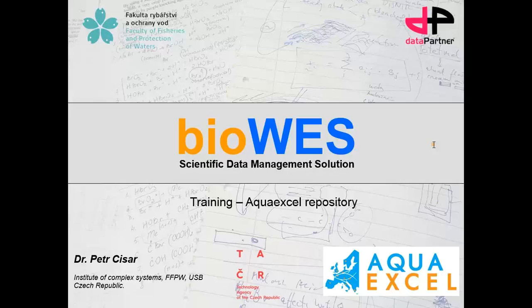On the second day, which is on Wednesday, we will go through the second part, where we will show you how you can describe your particular experiment, how you can attach your experimental data to the protocol, and how to manage your own protocols. On the last day, which will be on Friday, we will show you the extended features of the system. It means the plugins and modules for data processing and for communication with the measurement devices. And that should be the final part.